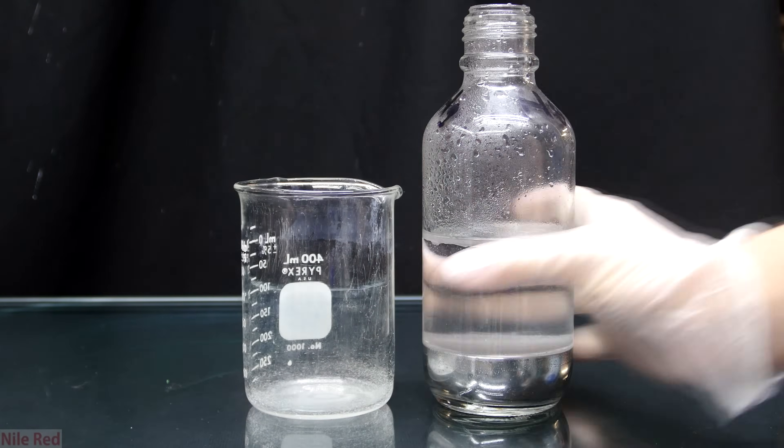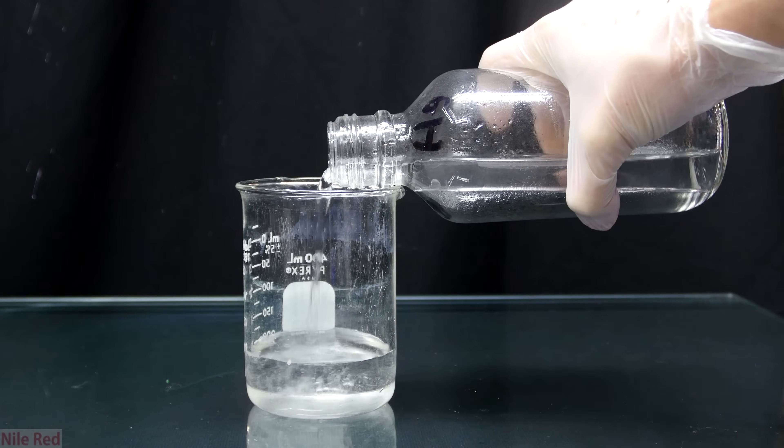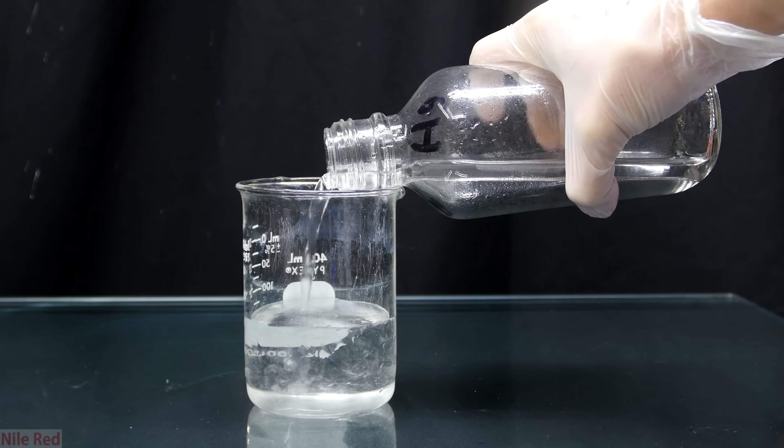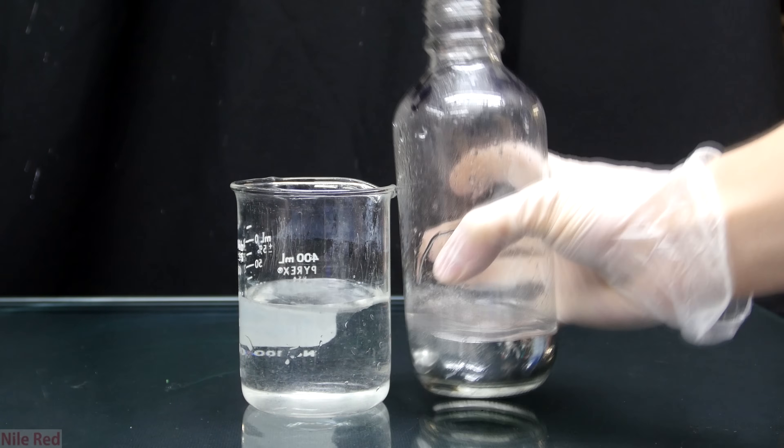The next thing I do is I open my mercury bottle and I pour out as much of the water oil mixture as I can. I want to get rid of as much of this as possible because it's really a waste of time to filter this through.